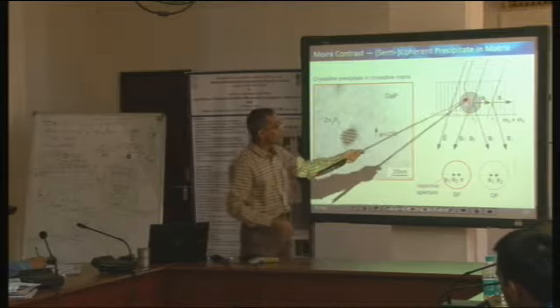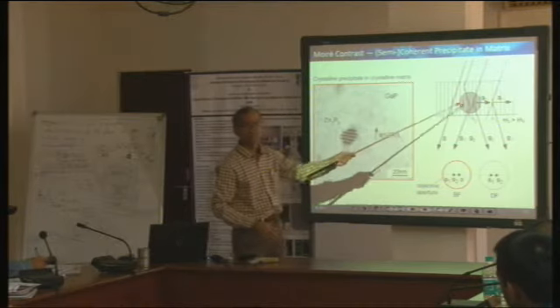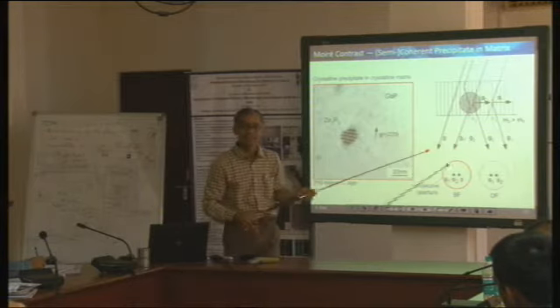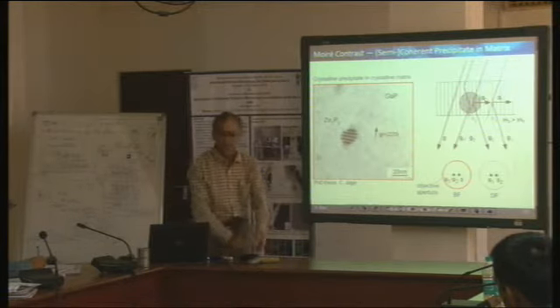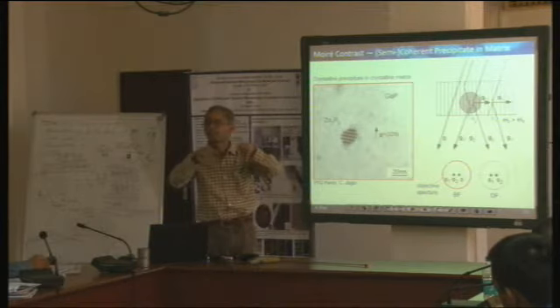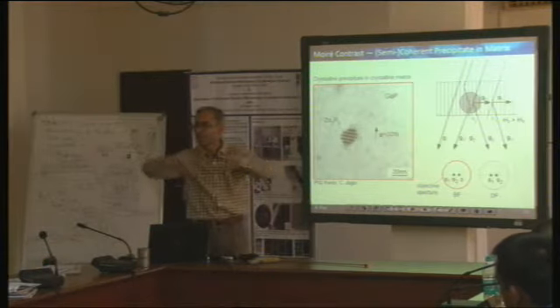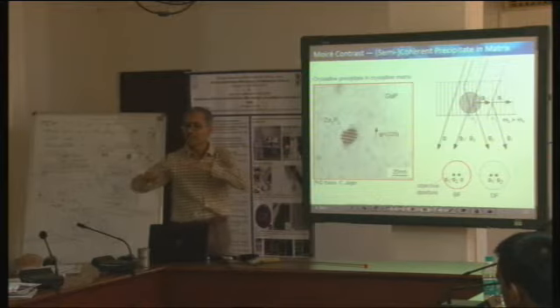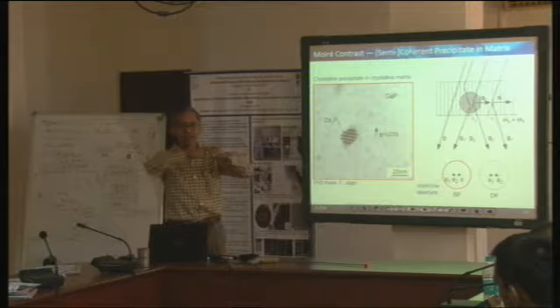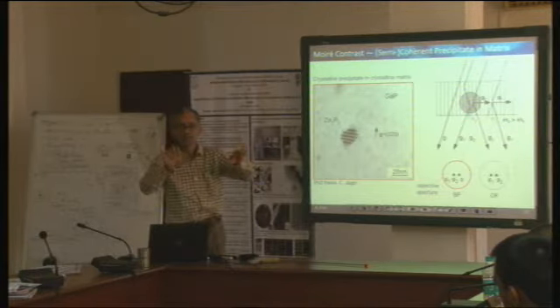This diffracted beam from the precipitate and the usual beam from the matrix can also interfere. You have probably seen that if you take two patterns, one transparency slide with one pattern printed and a second transparency slide, and for the time being assume that the spacings of these patterns are identical, no problem.